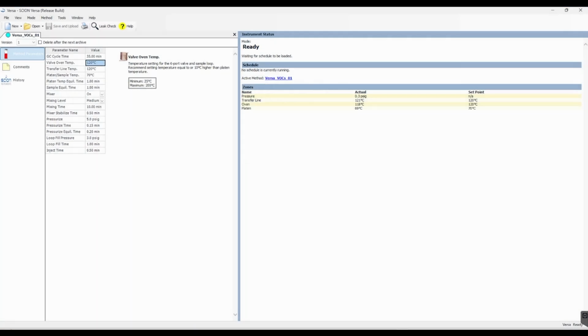Before you can build a schedule in the Versa software, you first need to have a method. Here, for example, we have a method that we've been using for VOCs. If you wish to know how to make a method, please see our other videos.